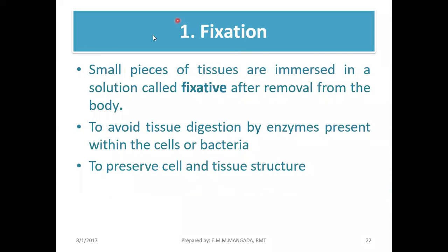So the first step is of course fixation. The purpose of the fixation process is of course to preserve our specimen.